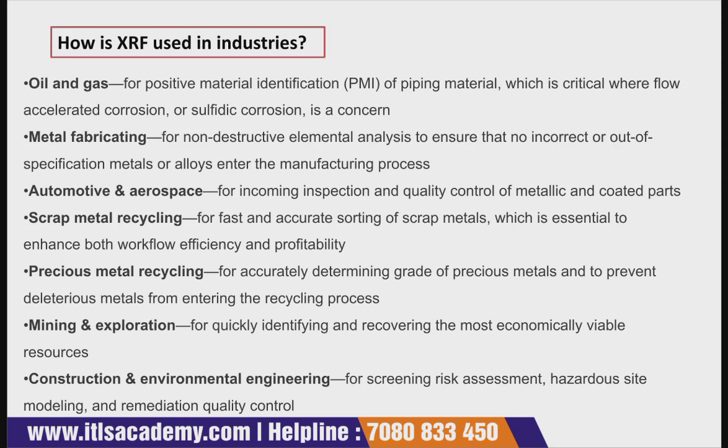Then in metal fabricating, it is again a non-destructive element analysis. As we already know, X-ray fluorescence spectroscopy is a non-destructive analytical method. So it is used to ensure that no incorrect or out-of-specification metal or alloy enters the manufacturing process. Then in automotive and aerospace, it is used for incoming inspection and quality control of metallic and coated parts.